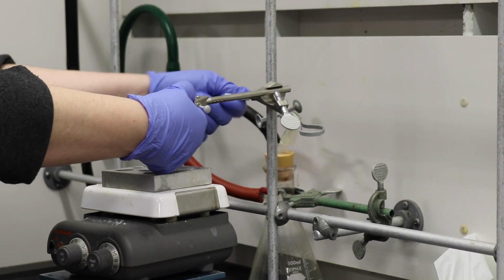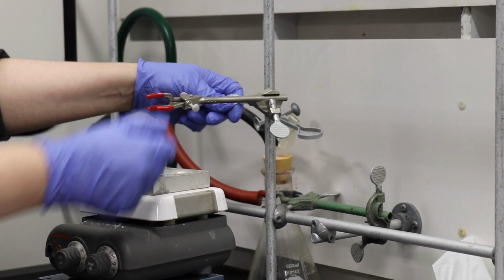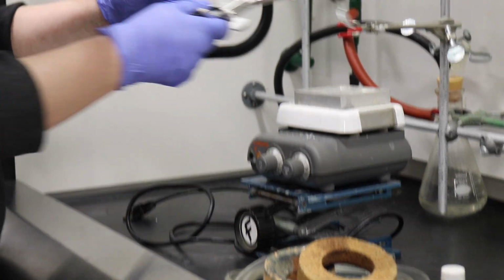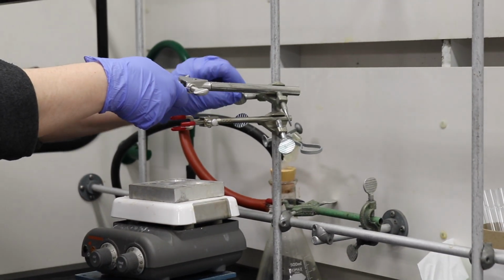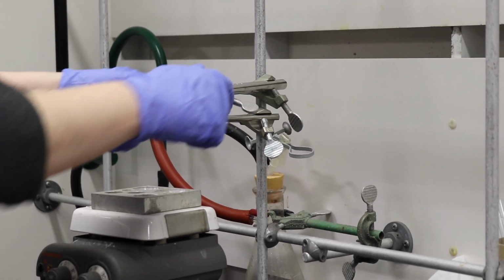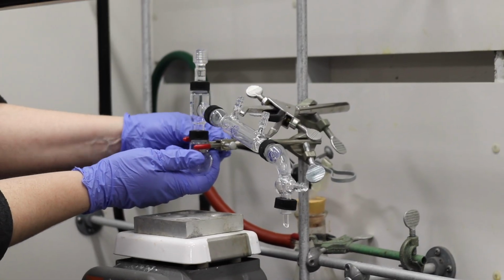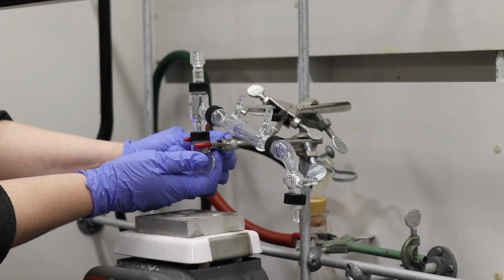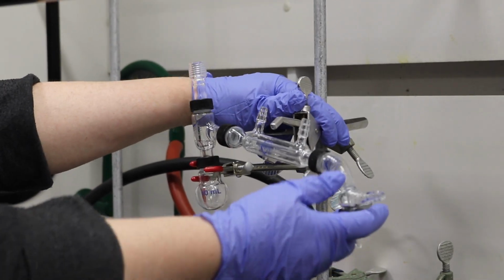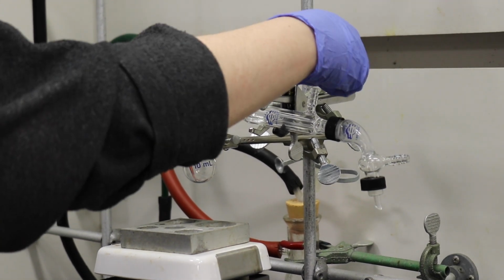We're taking a small clamp and securing it to the back, as you see here. This is going to hold our round bottom flask in place. Then we're going to take the larger clamp, put it right on top of the smaller clamp, and this clamp is going to be used to help secure our condenser. As you see here, we're securing the round bottom flask. Once that's secure, we can now use our bigger clamp. We can rotate it in any way, and now we secure our condenser.